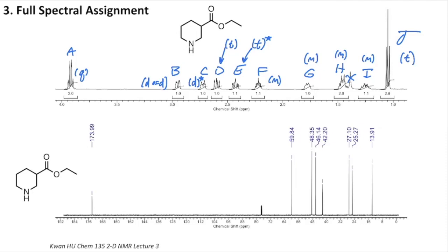So now that we have the labels, splitting patterns, at least preliminary splitting patterns, and integrations, we can move on to the carbon and see what is happening down there. Take a quick break here if you need one.